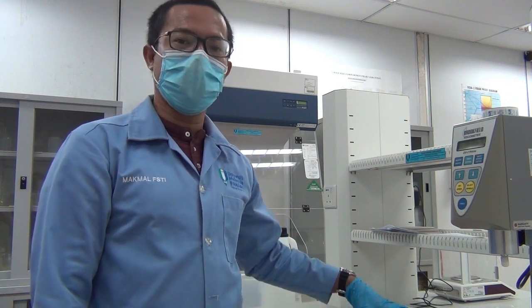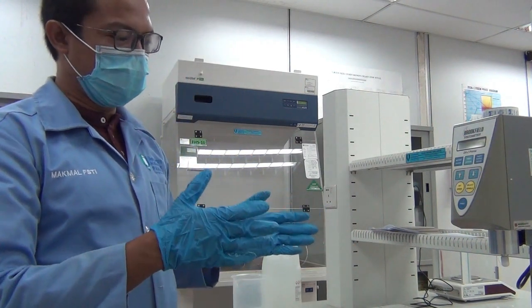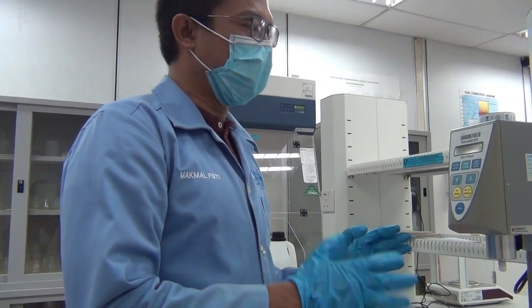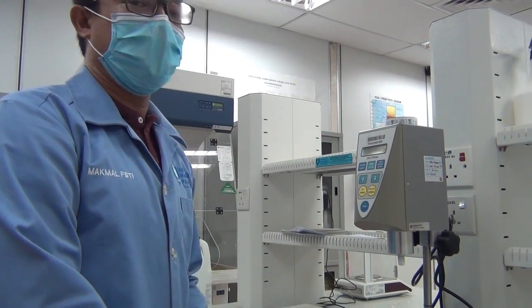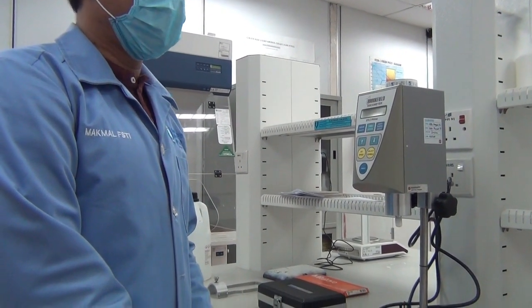My name is Ahmad Salihin Samsudin. I will explain how to use the viscometer for evaluation of viscosity of material. This is part of the subject Rheology and Colloid Laboratory, BSP2432. This is an instrument that we will use to measure the viscosity of material. The name of this viscometer is a Brookfield viscometer that we have in the Faculty Industrial Science and Technology Laboratory.